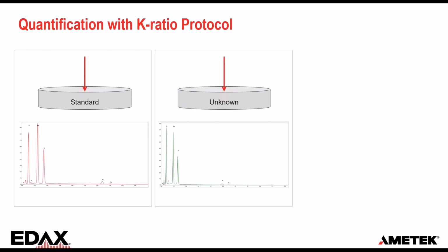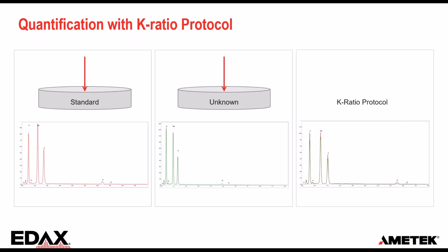And this is why EDS is called a comparative method. And in the first example, we have already seen some advantages of measurements with standards, and now the question arises, why is this not the default quantification routine? But we clearly see that we have to take more effort in terms of time and knowledge, and this makes this method a rather unpopular one.